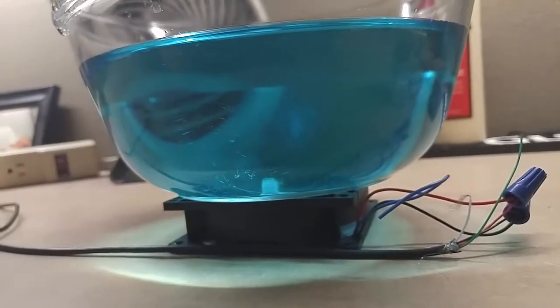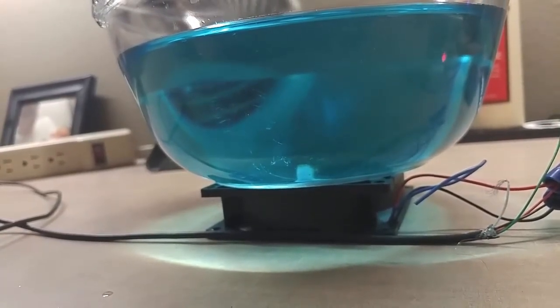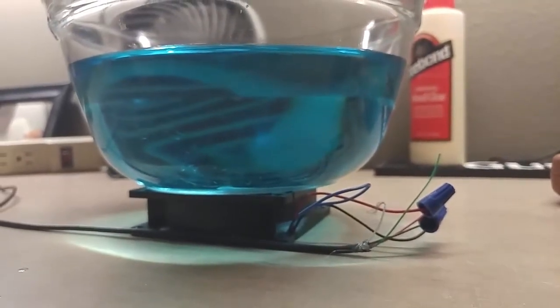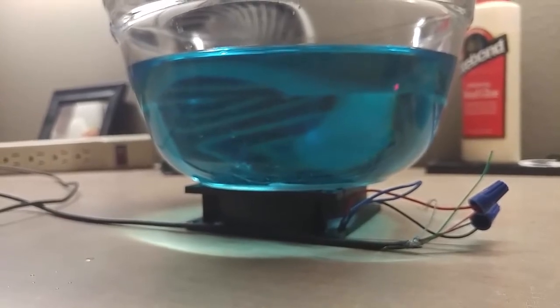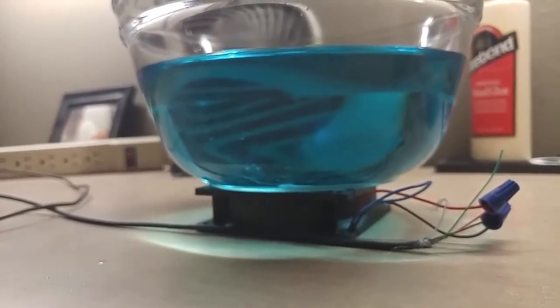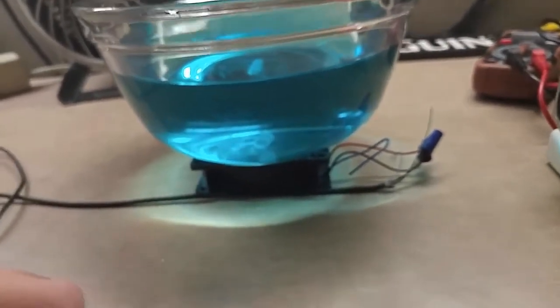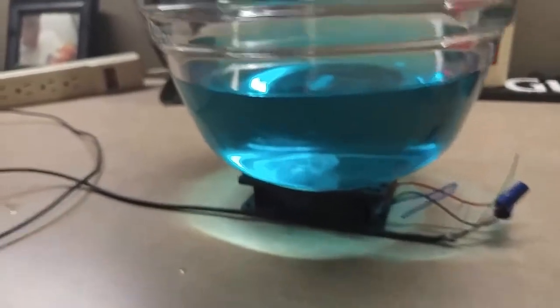As it is, this entire setup cost me whatever the price of that stir bar was — I think on Amazon it was like $4.98 with free Prime shipping. Compared to the models you can get from industrial, scientific, or homebrew suppliers, which are many times the cost, I think it represents a pretty good value. $5 for something that gets the job done versus $70 or $100-plus for something that looks a little more presentable. I may put this in a plastic project box to hide the wires and dress it up, but as it is, it does what I needed it to do — and at the end of the day, that's what matters.